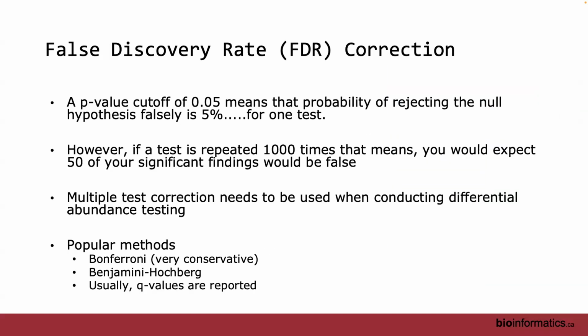So that's great, and we'll talk about a few of those methods. One important aspect of that is false discovery rate. So I remember I talked about facts and opinions. I think this one's probably mostly a fact. Although it's amazing that there are still tools out there that won't apply a false discovery rate, almost 99% of the time, you should be really thinking about correcting for false discovery rate. If you haven't heard of this before, in classic statistics, using a p-value cutoff of, say, 0.05, if you recall back to some stats history a long time ago, means that you're rejecting the null hypothesis 5% of the time, and you're okay with that as your probability.